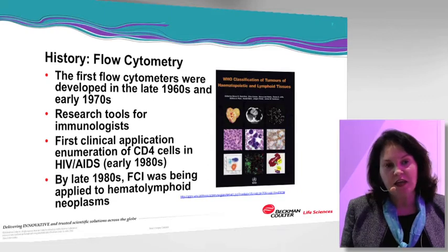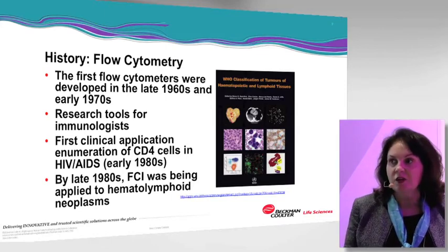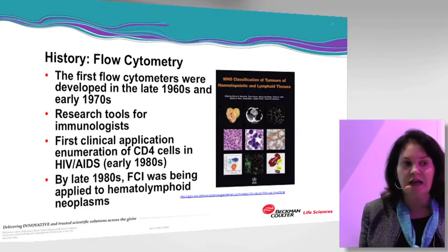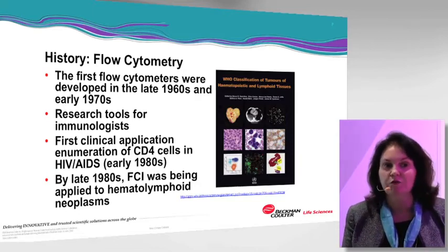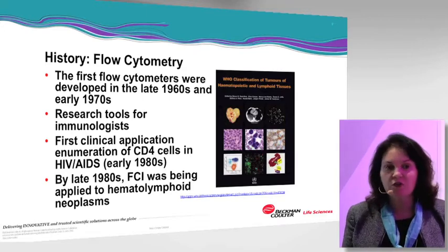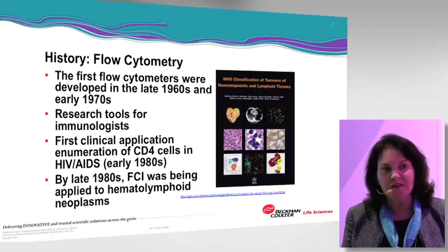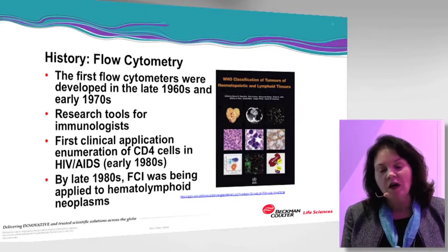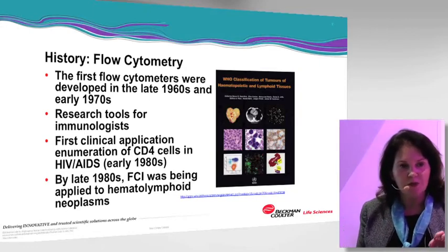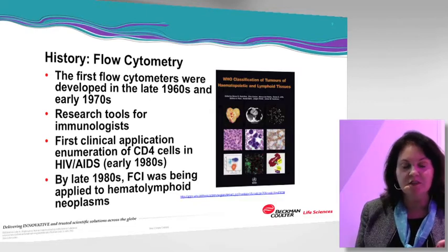What happened is, in the wake of the AIDS epidemic, it was understood that CD4 positive cells were the cells of interest when it came to HIV. And so enumeration of CD4 positive T helper cells was the first assay routinely performed in clinical laboratories. Due to the urgency of the clinical situation at the time, these instruments were essentially rushed into the clinical lab. In the course of using the technology, those of us who do leukemia and lymphoma testing came to understand that if you could use flow cytometry to look at the normal immune system and diseases that affect it, it might be possible to use the same platform to study malignancies of the immune and hematopoietic systems.